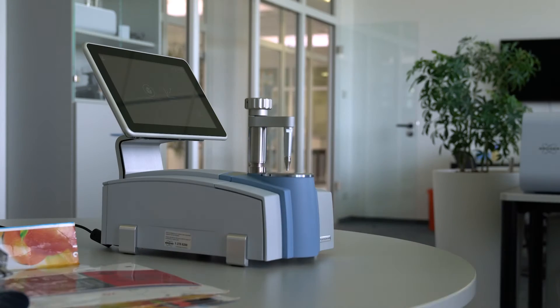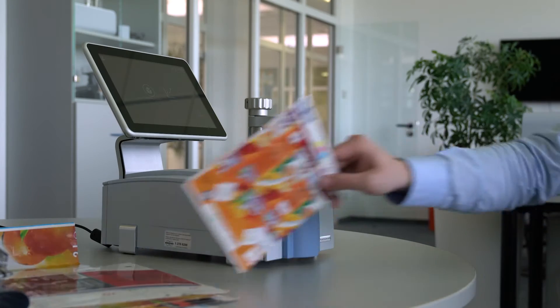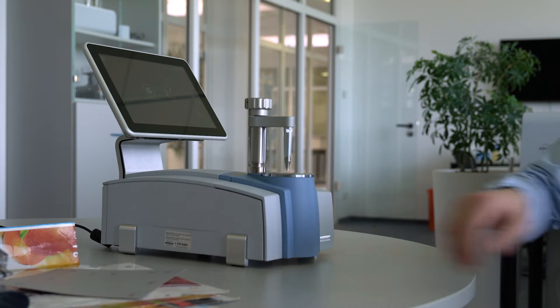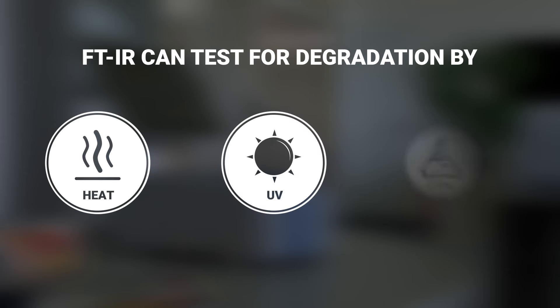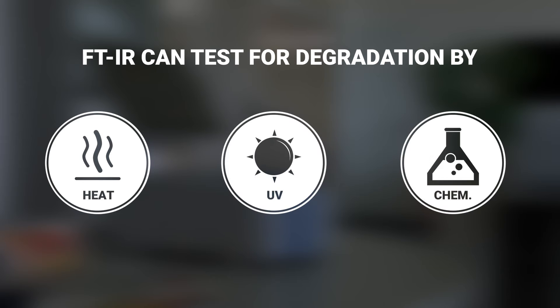These damages can significantly impact a food's shelf life or safety. FTIR Spectroscopy can check polymers and plastics for signs of thermal, UV or chemical damage.